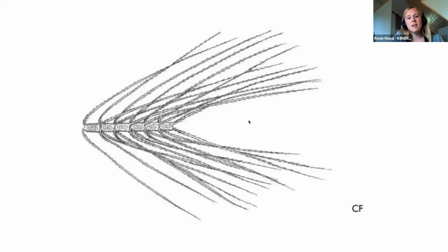All right, and these are pretty dramatic cells to see under the slide. They can be quite large, and what we're looking at right here is the girdle view, so it looks rectangular and long, whereas if you're seeing it top down, the valve view cells are round.